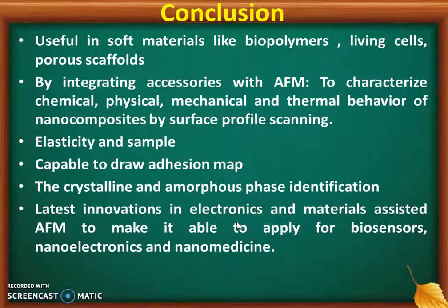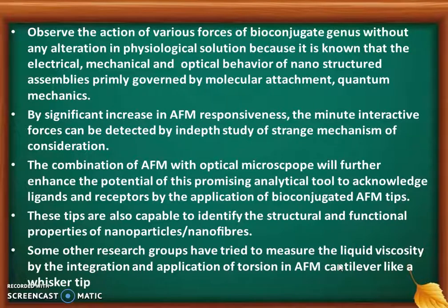Latest innovation in electronics and materials has assisted AFM to be applied to biosensors, nanoelectronics and nanomedicine characterization, to observe the action of various forces of bioconjugates without any alteration in physiological solution. It is known that the electrical, mechanical and optical behavior of nanostructured assemblies is primarily governed by molecular attachment and quantum mechanics, which can be easily identified by means of AFM.